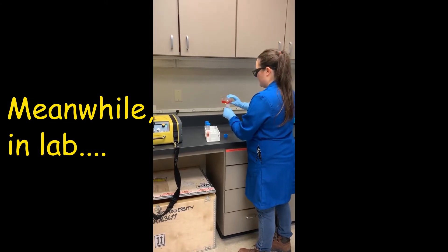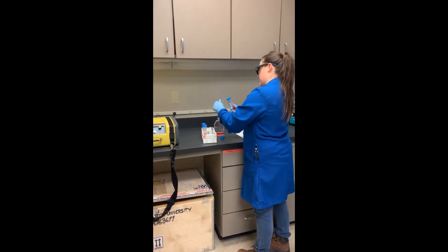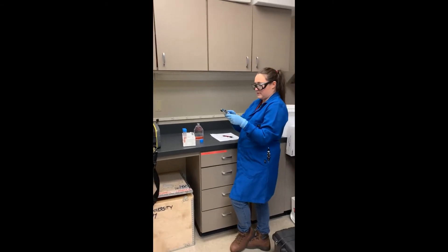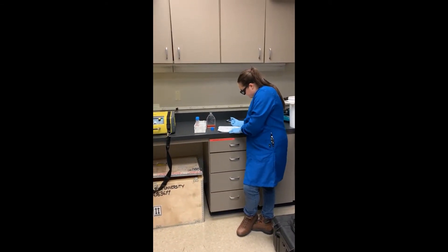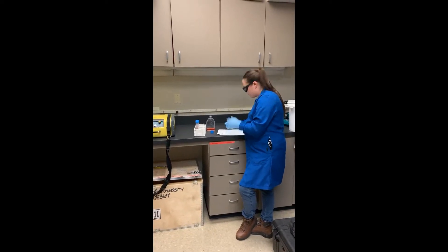So you're working in the lab one day and you've got to check your phone, complete your homework for another class, scratch your nose.